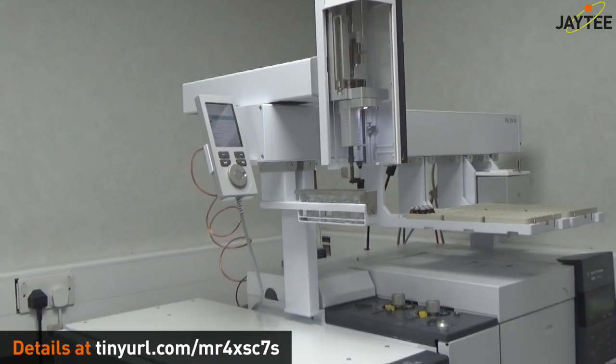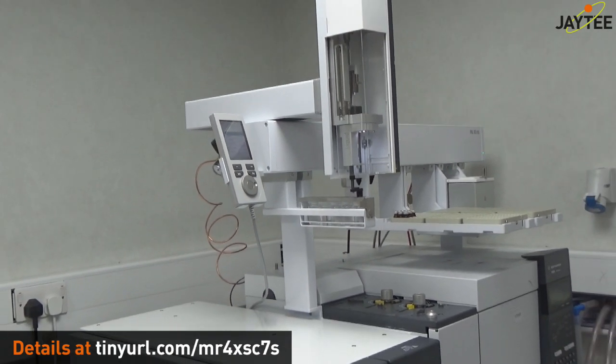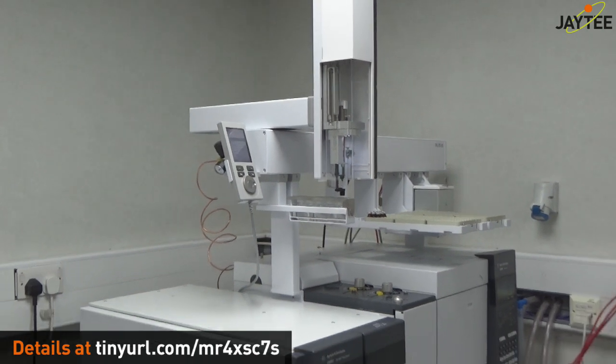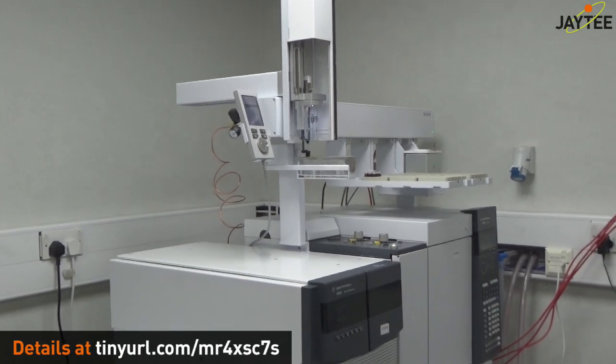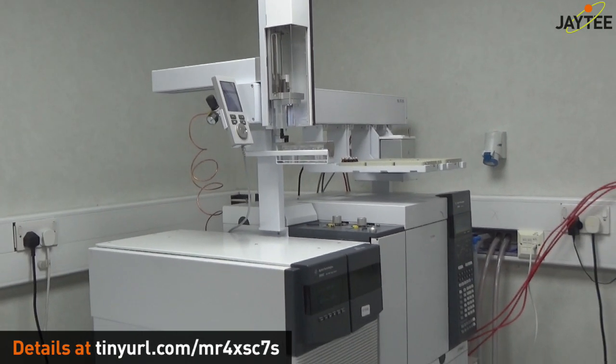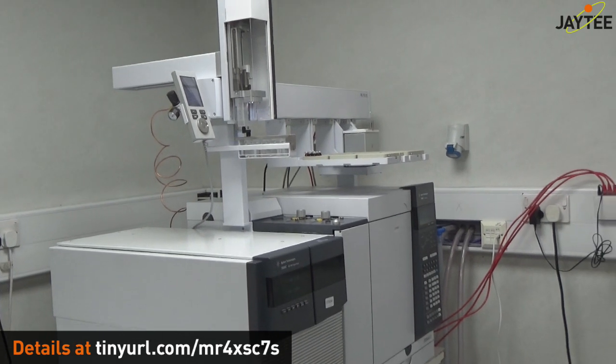And the GC has twin inlets so also two columns can be fitted and also there's a system inside where you can change the column without having to evacuate the mass spectrometer every time.